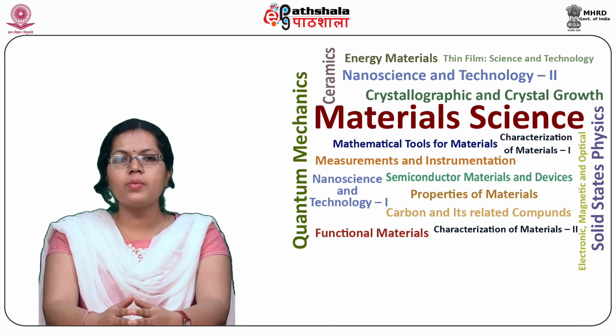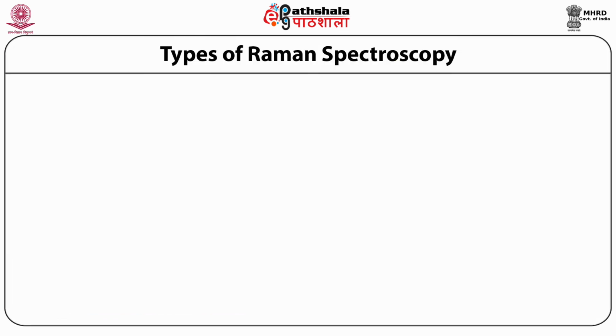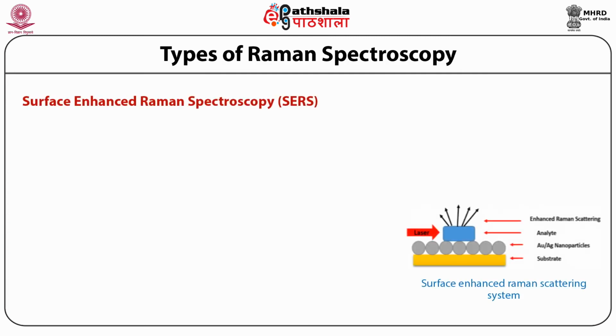This renders Raman spectroscopy best for qualitative examination of substances. Students, now let us see the different types of Raman spectroscopy. First, the surface enhanced Raman spectroscopy or SERS.